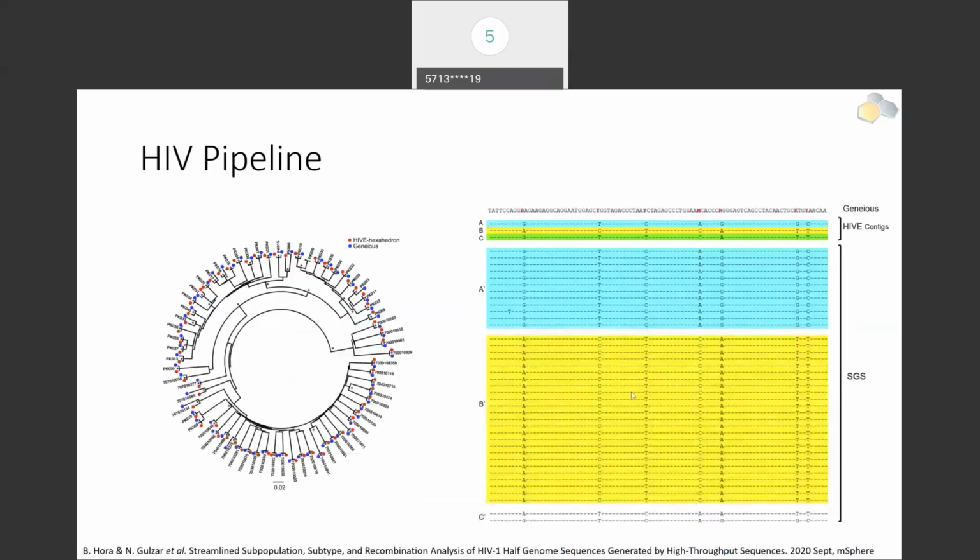This work has been tested against multiple approaches, one being the Geneious assembler, a proprietary de novo assembler, which practically cannot resolve the quasispecies, but it can identify all these arbitrary positions, and it reports those.